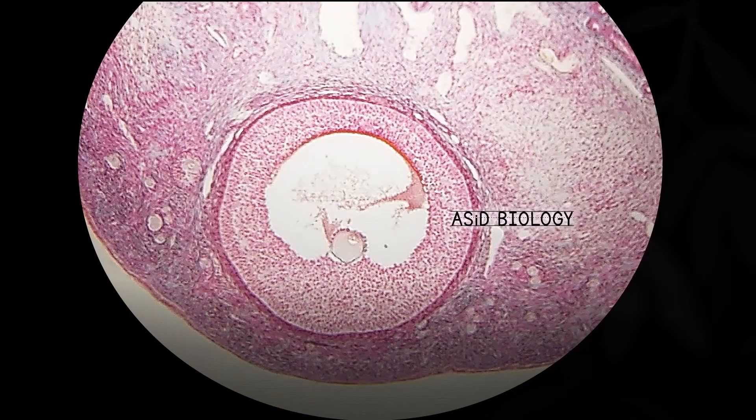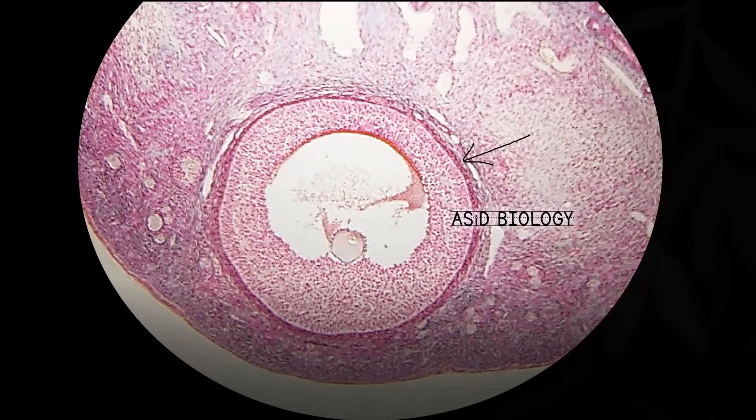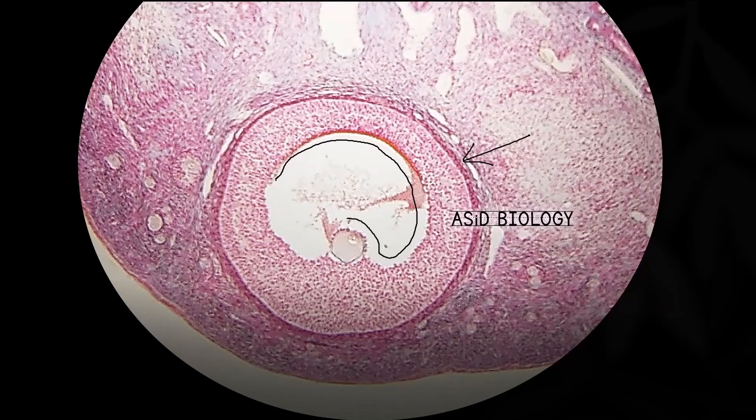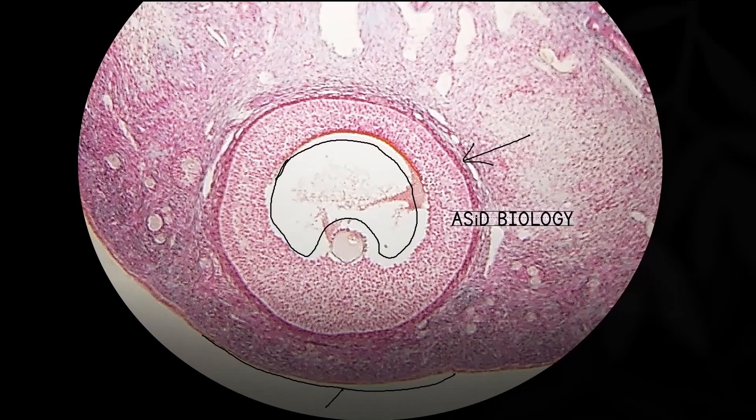This is the structure of a secondary follicle. You can see that the secondary follicle has a fluid cavity and it grows very large near the edge of the ovary. The secondary follicle has layers of follicular tissue that is called granulosa cells. Granulosa cells are also able to secrete hormones.